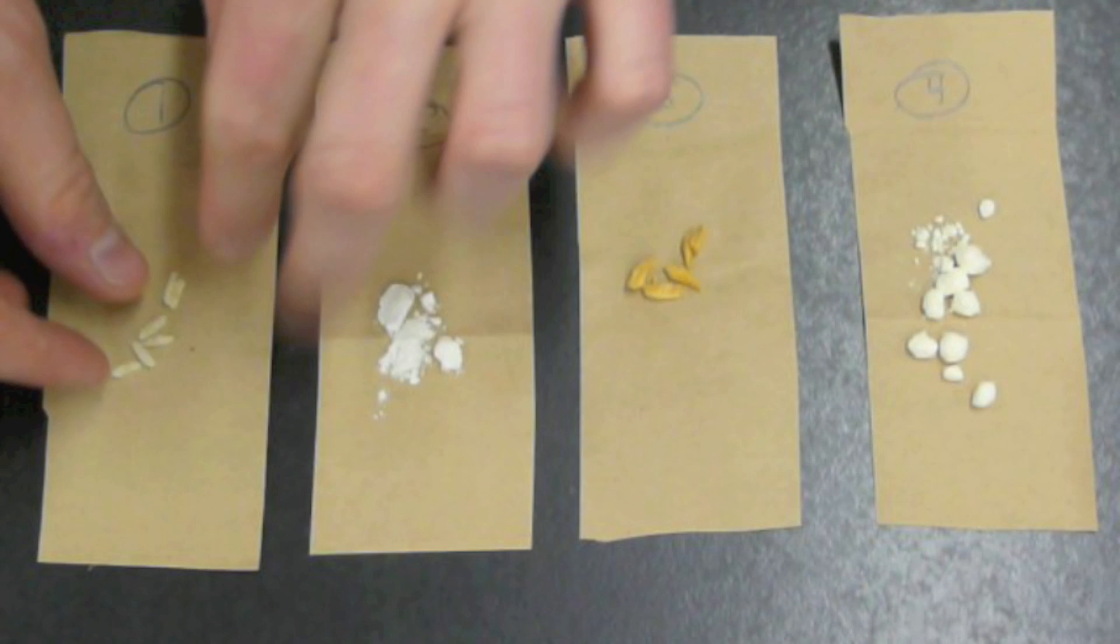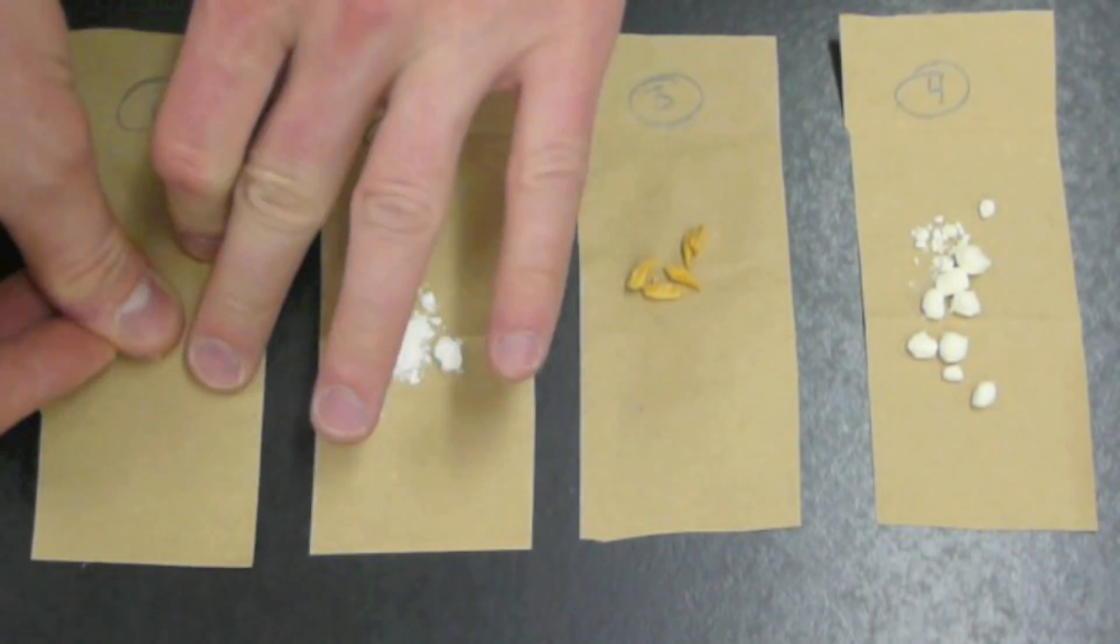In this experiment we'll be testing foods for fats and the test material we're going to use again is a paper bag. We're going to be taking each food and rubbing it into the bag first, as you can see here.